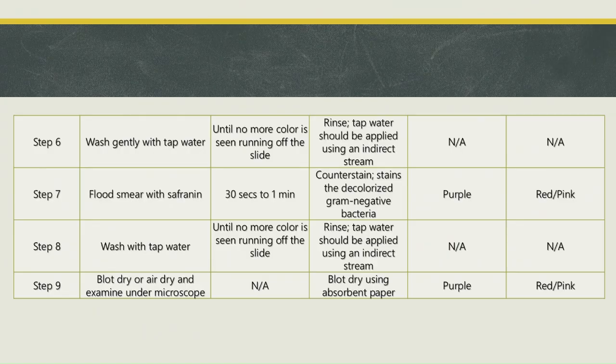Step 6. Reagent/action, wash gently with tap water. Time, until no more color is seen running off the slide. Function, rinse, tap water should be applied using an indirect stream.